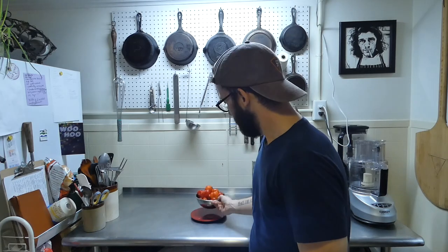I'm your host, Chef Dan Williams, and today we're going to be doing a capsaicin extraction. So to start, you're going to need the chili of your choice. I'm using habaneros, but you can use any type of hot chili that you want. So I have 263 grams here, so let's get right on into it and I'll show you what to do.